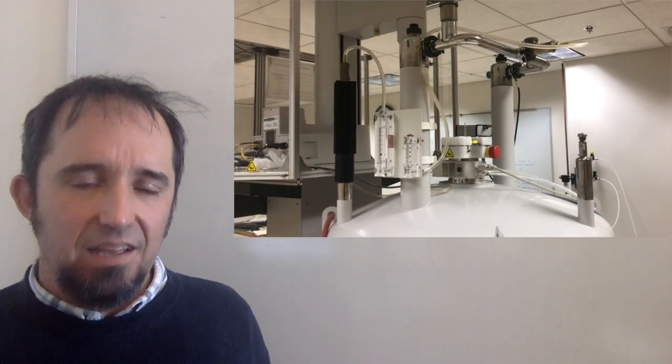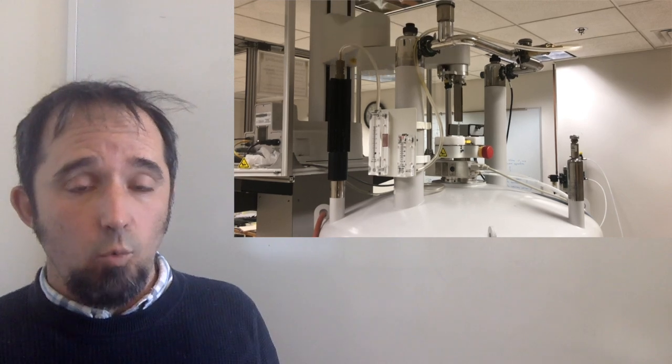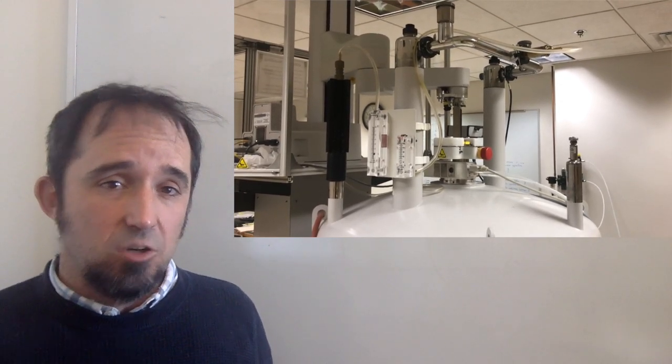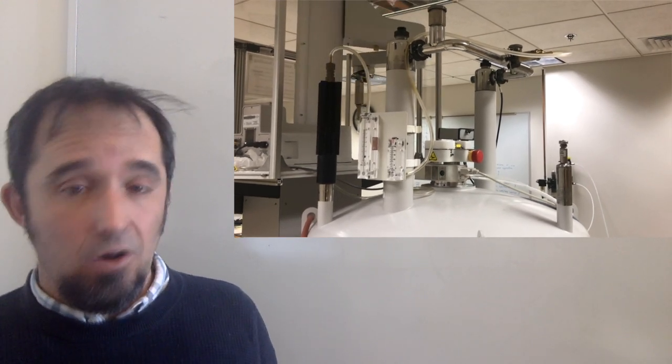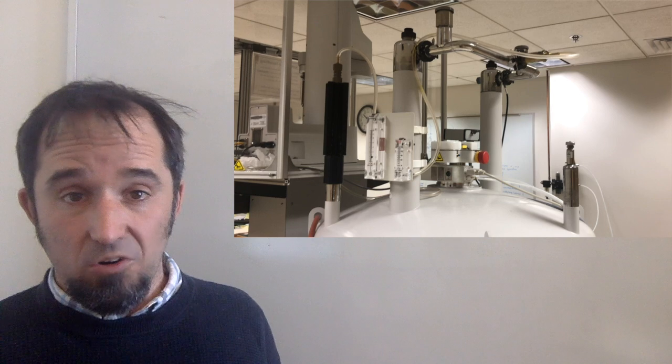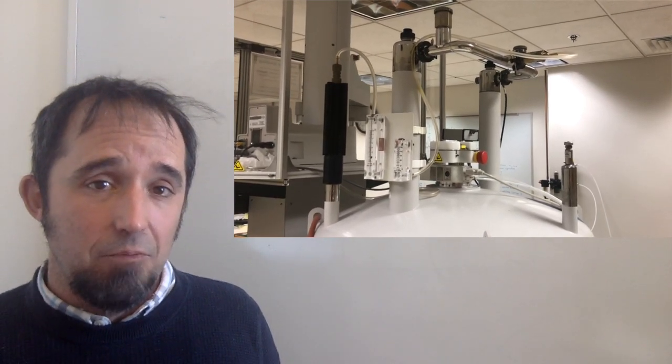Our auto sampler lets us load up a bunch of runs and just keep them running while we're not at the instrument. Looking at a proton spectrum usually takes something like 5 minutes apiece. If we're looking at a different nucleus like carbon, it can take up to half an hour or several hours, depending on how close a look we want to take. But the auto sampler helps us do this pretty efficiently.